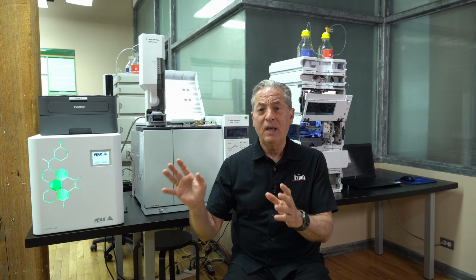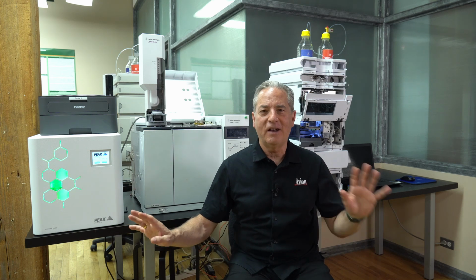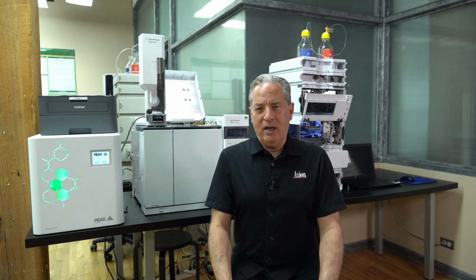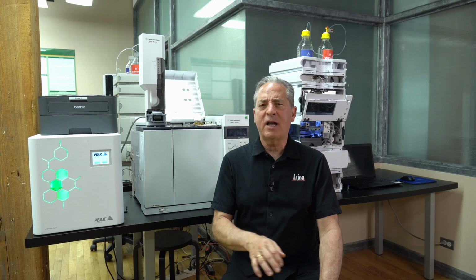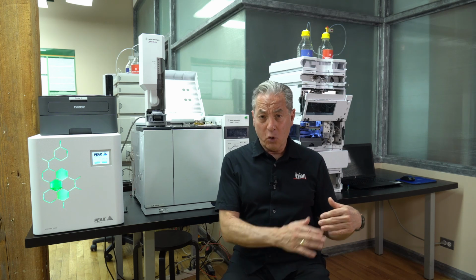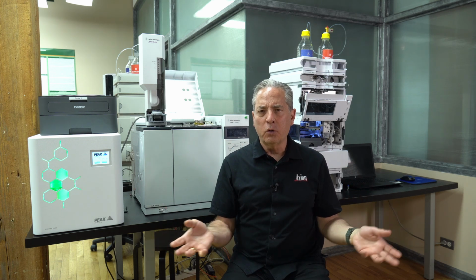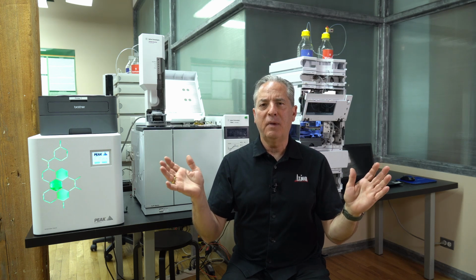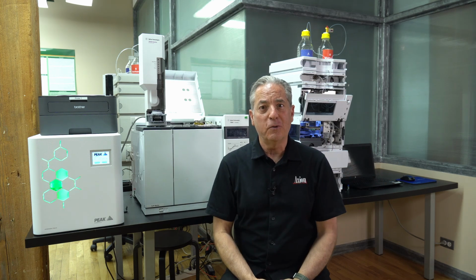In HPLC, analogous situation. Remember, everything in GC has the same analogous situation in LC. In LC, we use terms isocratic and gradient. So isocratic means one solvent strength. We're going to run 15% acetonitrile through the entire run, whereas a gradient means we're going to start with a weak solvent and program to a strong solvent. We always go weak to strong. So in the reverse phase world, we're going to go from 10% to 100% acetonitrile in, let's say, 15 minutes. So there's your definitions, and that's a low-hanging fruit. You should know those when you're going into your interview.